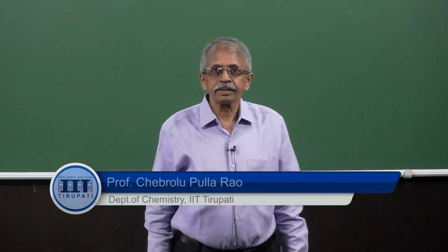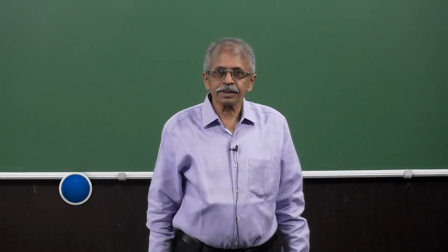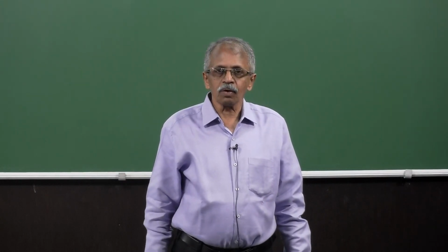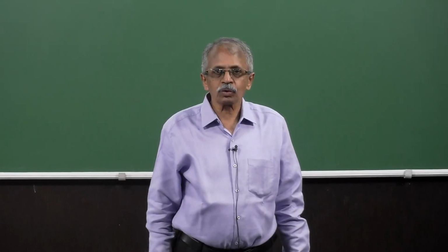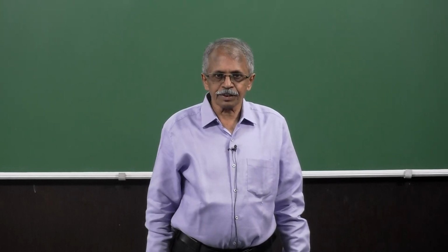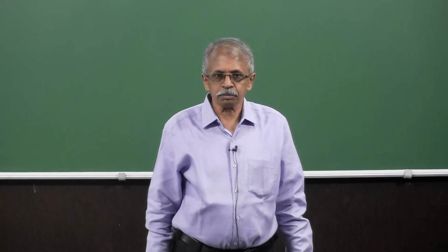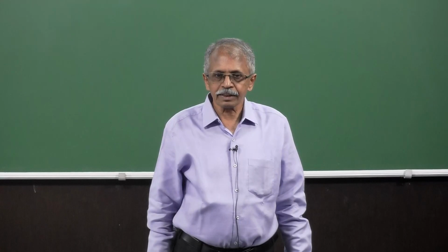Good morning. Welcome you all to this next lecture in this particular series, particularly on the microscopy aspects that we have been discussing in the previous class. The microscopy aspects, particularly the atomic force microscopy that we have been looking at.